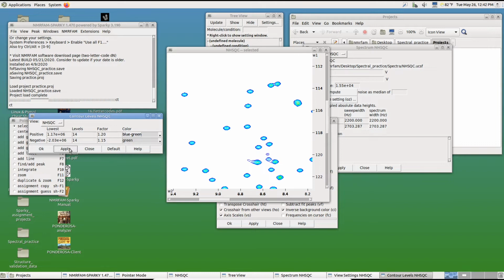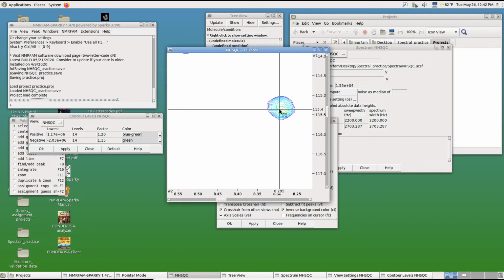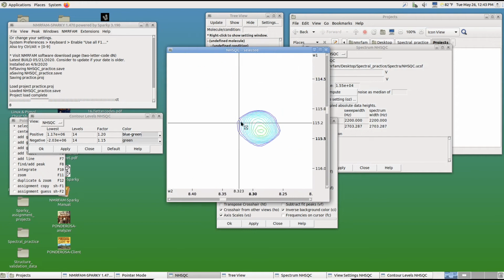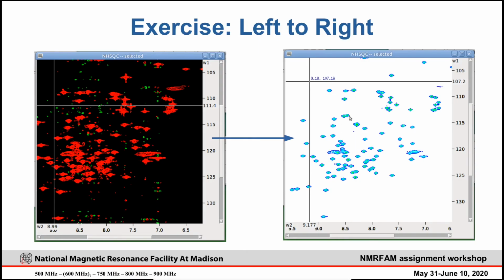And actually blue to green. So depending on the intensity level, data height, a gradient color has been applied, blue to green like this. So actually this was blue to green.